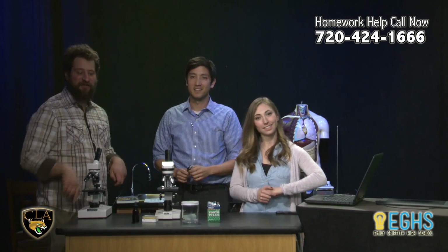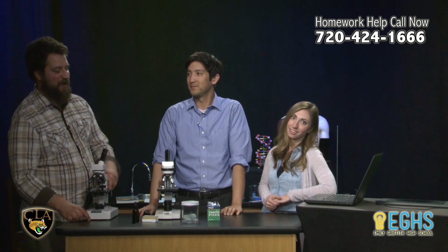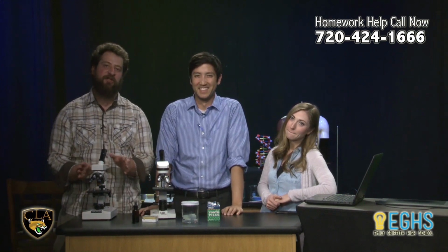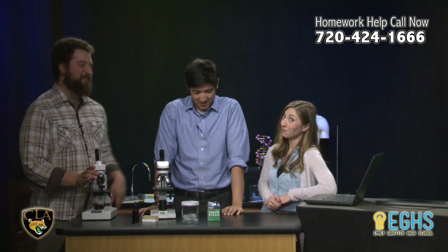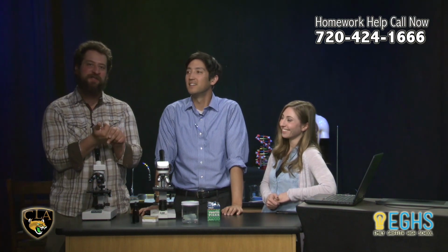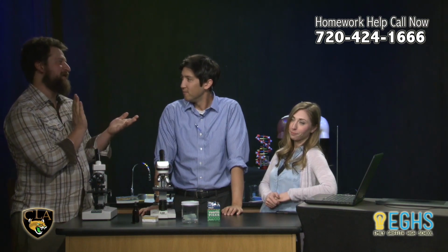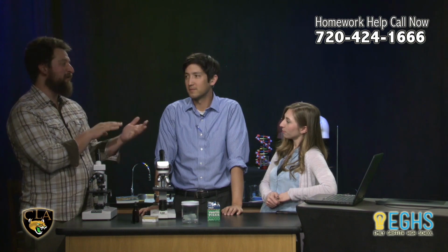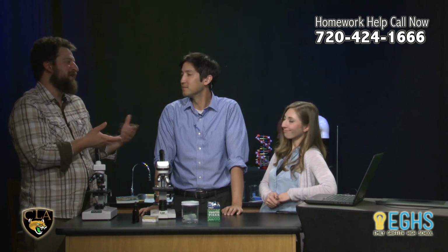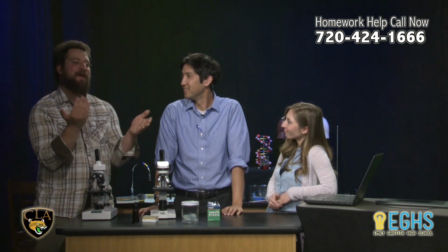All right, welcome back to the science lab here. So we're just getting set up, but what I'm going to have us do today is take a look at cheek cells, our own cheek cells, actually. I did this with my students recently. We're doing a cell biology unit, and it's easy to look at prepared slides of cells from other organisms, but it's kind of neat to see your own cells. So this is a fairly simple thing to do.